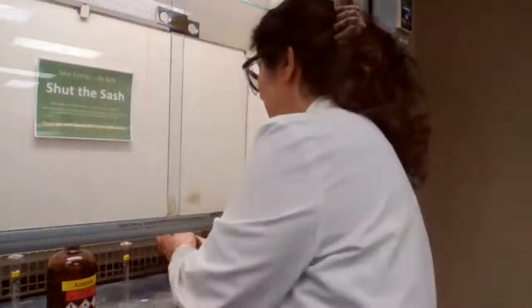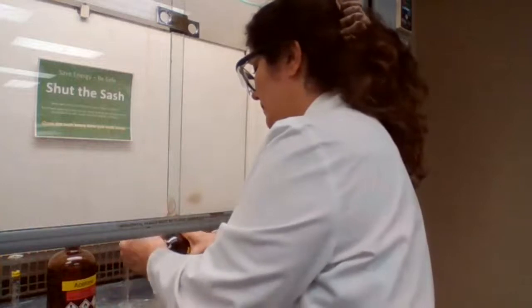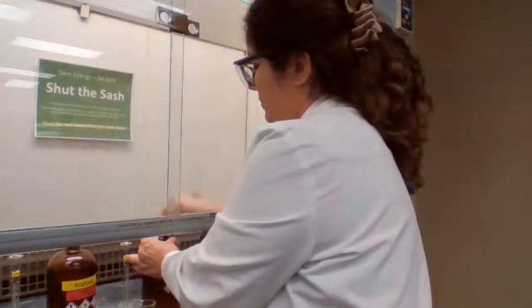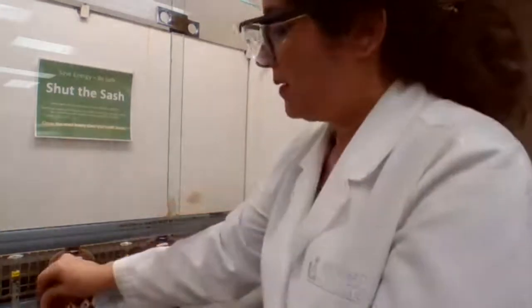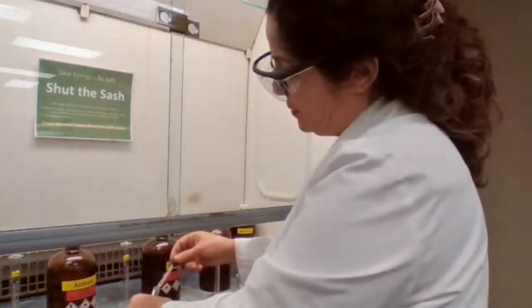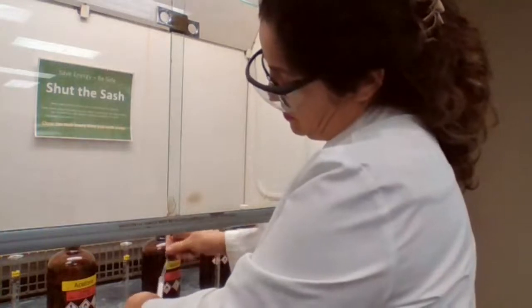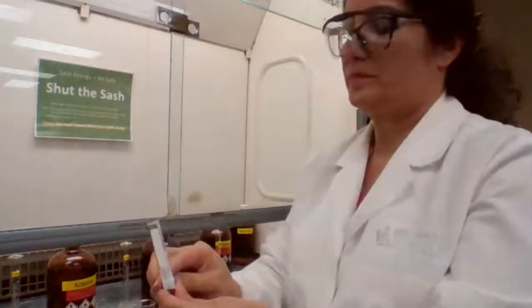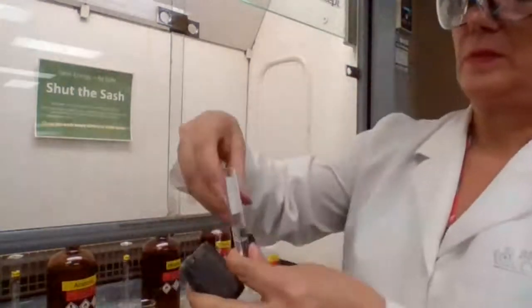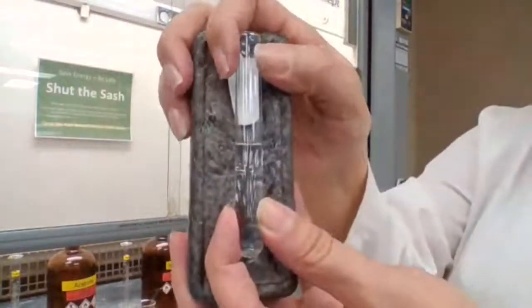We are going to use hexane. Going to add hexane to the second test tube.